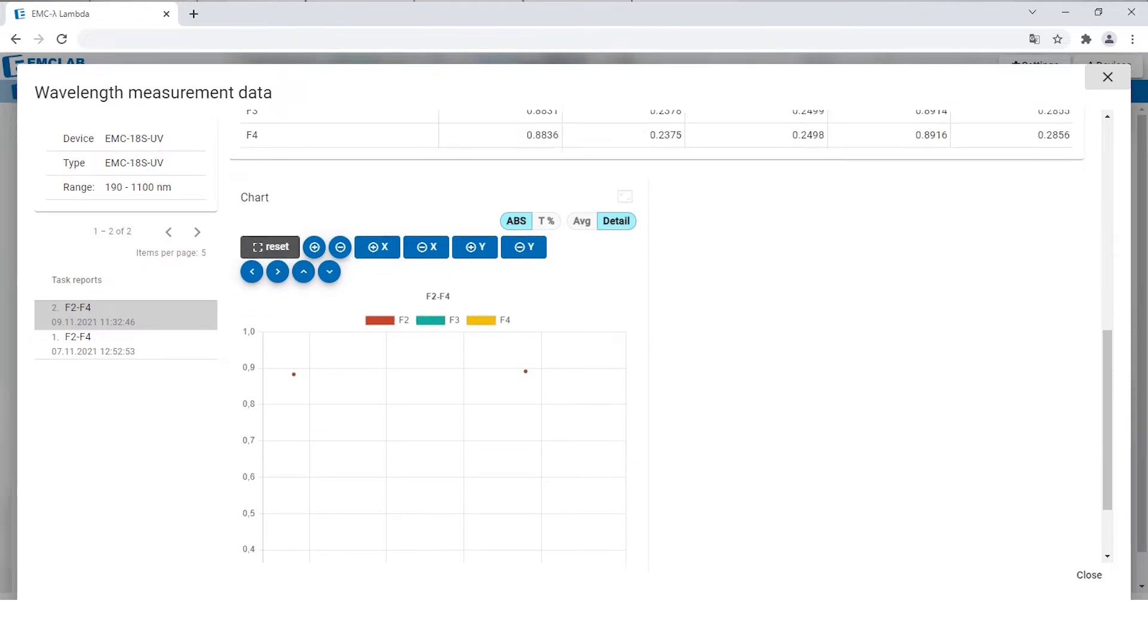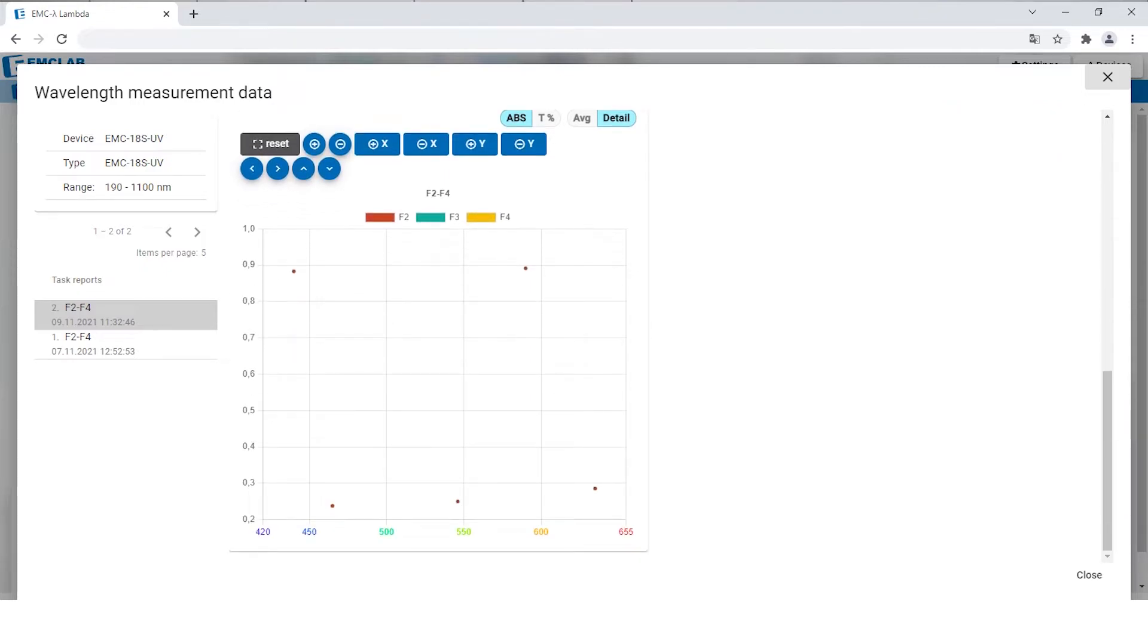Beneath the table there is a scatter chart where all the measured points are shown.